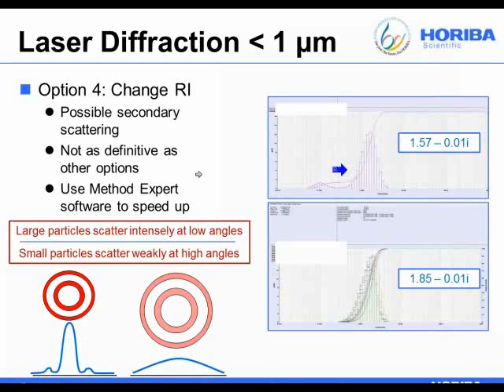So that's a long explanation of a very important principle. And again, refractive index is the most common question. If you have concerns along these lines, please contact me. I'd be happy to point you to different places on the website, or depending on how much time my son gives me at home, I can answer you directly as well.